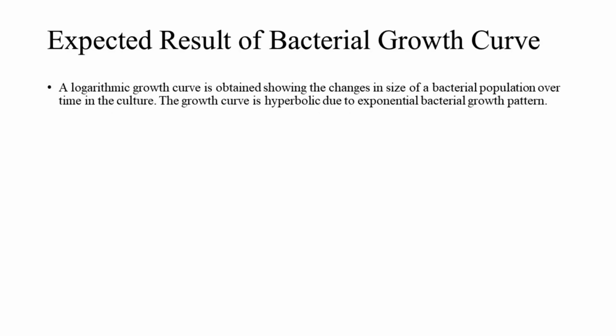Expected result of bacterial growth curve. A logarithmic growth curve is obtained showing the changes in size of a bacterial population over time in the culture. The growth curve is hyperbolic due to the exponential bacterial growth pattern.